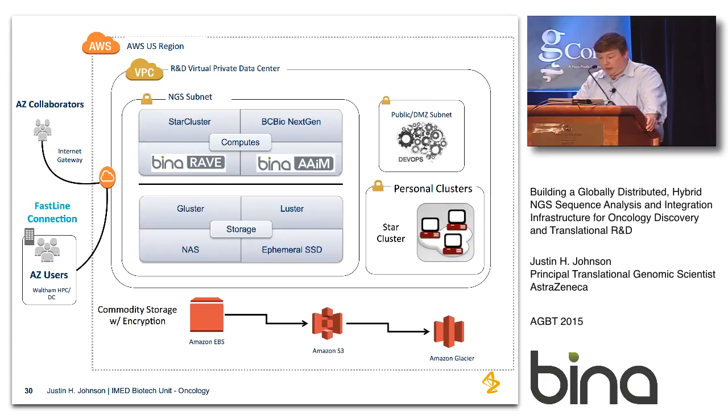I think one thing that shouldn't go unnoticed is that there are a lot of platforms out there that are good cloud platforms, and a lot that are really good local platforms. But to have to develop a local strategy and a cloud strategy not together is sometimes a little daunting. So this gives us the ability to process data in the same way, with the same algorithms and the same workflows and the same provenance, both locally and in the cloud.